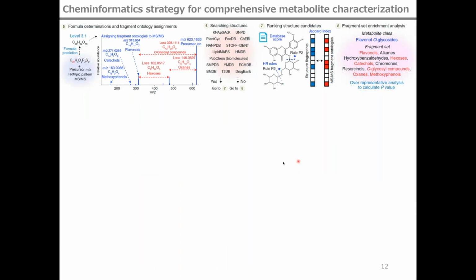The current MS-FINDER program enables us to perform molecular formula prediction, metabolite class recommendation, and searching structures of the target molecular formula.